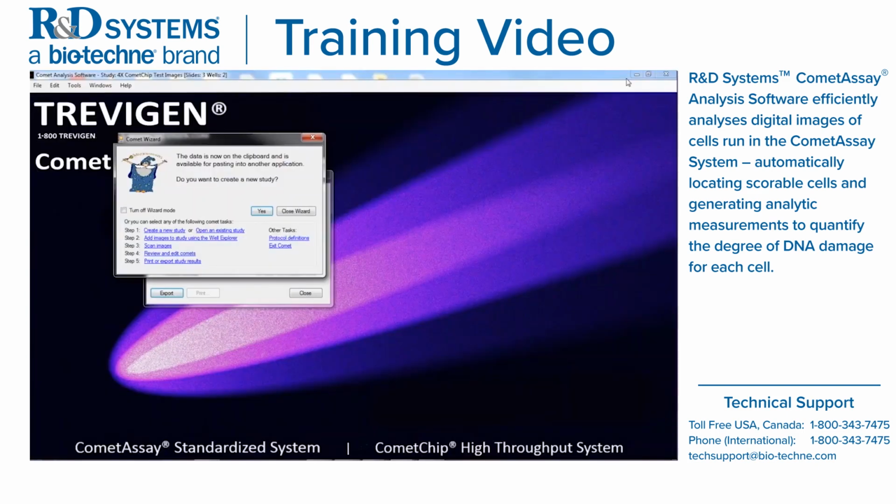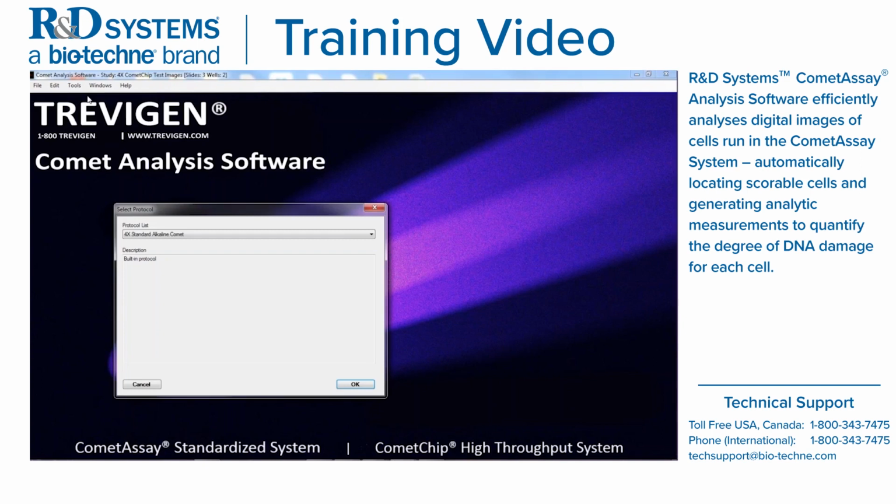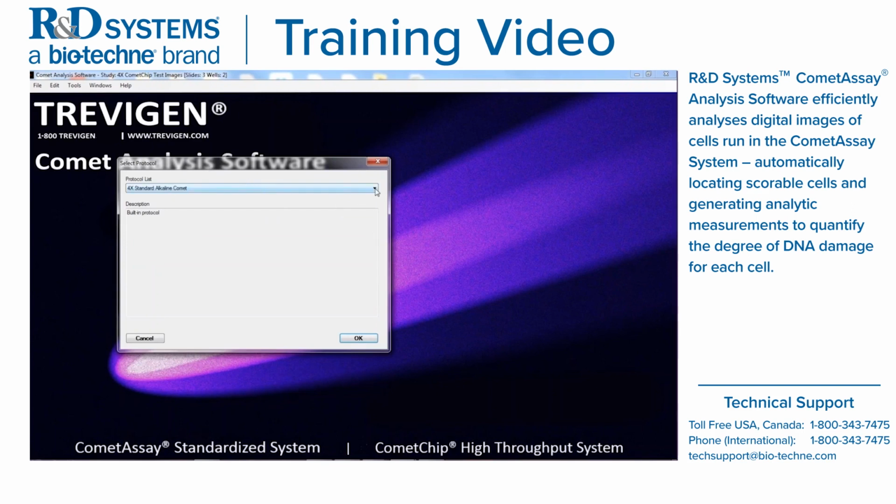Okay, so now what we're going to do, let's talk about the heart of the software: you have to be able to draw the boxes around the comets within your images. So let's go to protocol definitions. If you have an image, the first thing I would recommend is test some of the default protocols on an image. So the software allows you to do this. So let's first, like I said, my images were CometChip, taken at 4x magnification. So let's first just see how we test. So let's select a protocol called 4x CometChip alkaline comet. Go ahead and select OK.